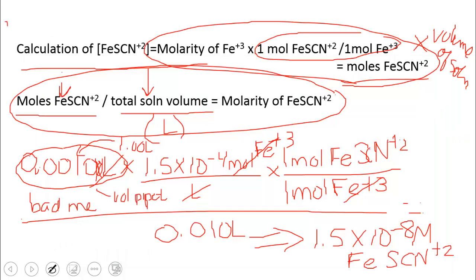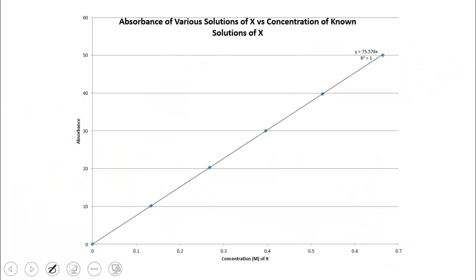Okay, now once we've made the calibration curve, so let's say this was my fake, and remember guys, this is totally fake, okay? When you have done your calibration curve, and you might just do it on your calculator just to make sure it's linear, you will be submitting a calibration curve with your report for the following week when it is due.